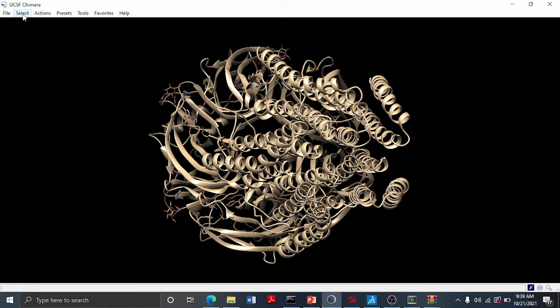So it gives us a clue to reduce the bulk of this target, reducing it only to chain A. Downloaded targets can also be remodeled on Swiss Model for targets that have incomplete residues. You can check that out and try remodeling any targets that you notice don't have complete residues.